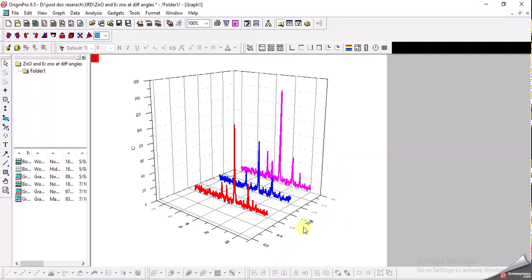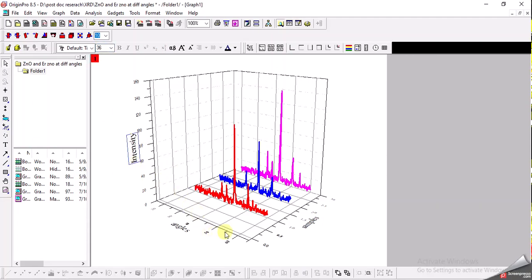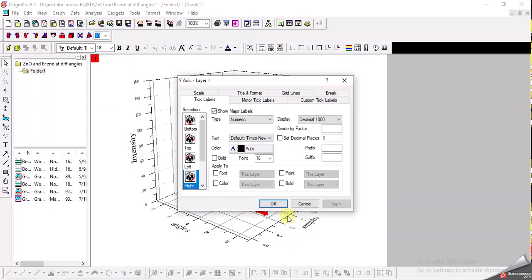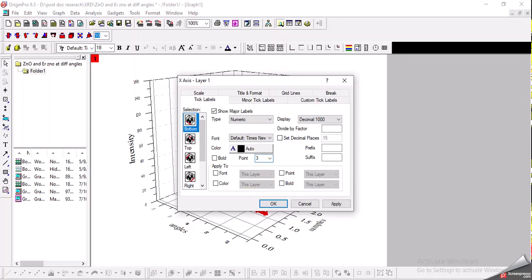Now we have a very nice 3D plot. I can also format the axes to make it more legible. Here 'experiment' is written - I will change it to 'Samples' since this represents the sample number. I increase the font size to 36. The x-axis label I set to 'Angles' with size 36. The z-axis label I set to 'Intensity' with size 36 as well.